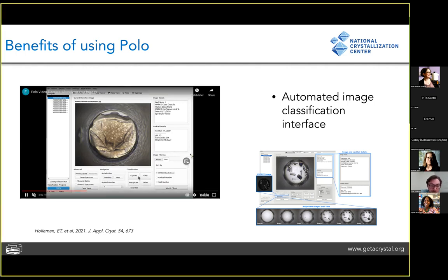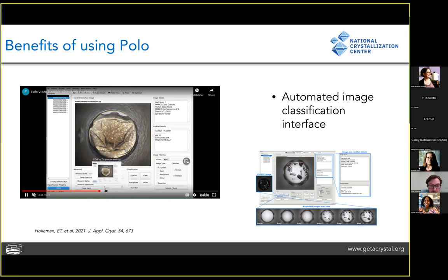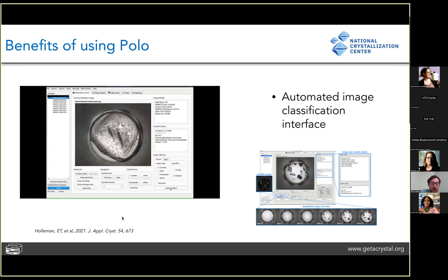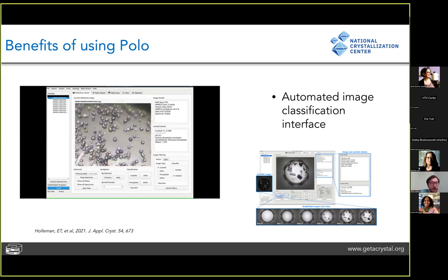And that's what you would be clicking on in this classification interface to add human labels to each of these images. And I think I'm going to submit the filters here in a second. And you can also change how the images are returned. So we're sorting them from the most confident to the least confident images. And so based on that classification, Marco thinks these are crystals. I don't know if they actually are.